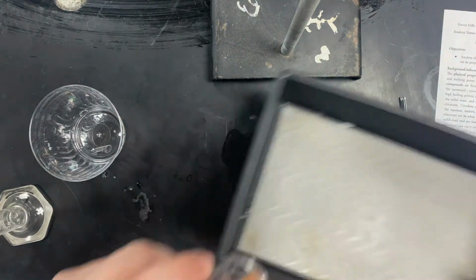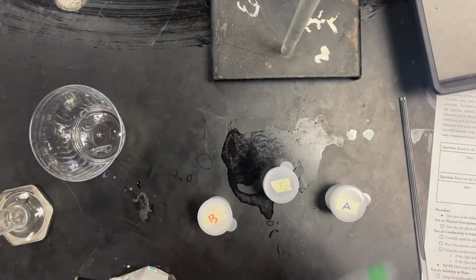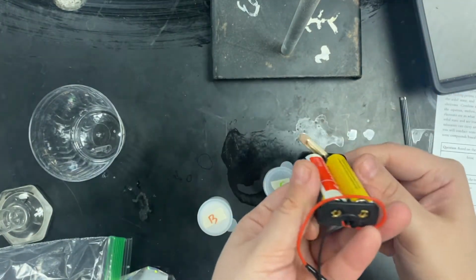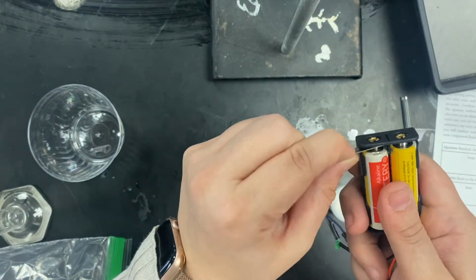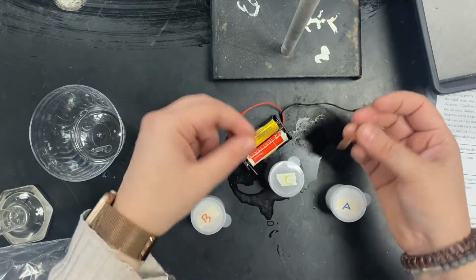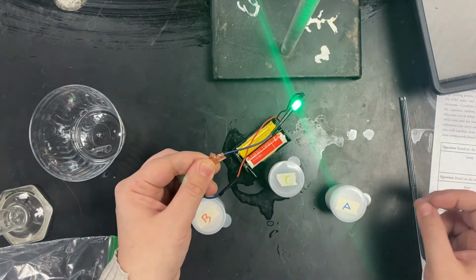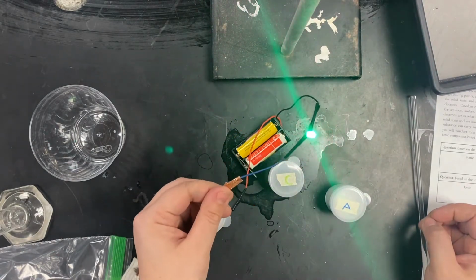For this, you're going to need to use your conductivity meter. Take it out of the bag. At this point, it should be off. Off is anything ranging from this to that. To turn it on, you'll put the switch inside the coil there. Just to make sure that it is on and working, you can touch the two copper ends together and you should get that super bright green bulb. If your conductivity meter does not work, give it to your teacher and they can grab you a new one.